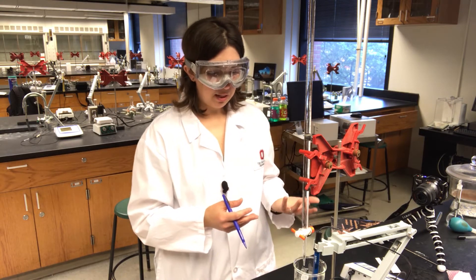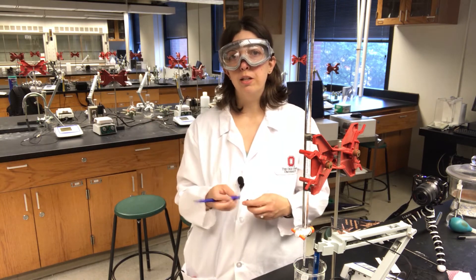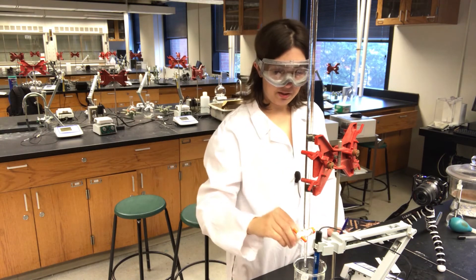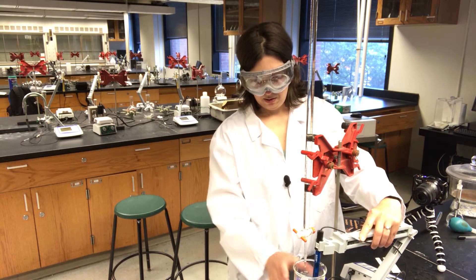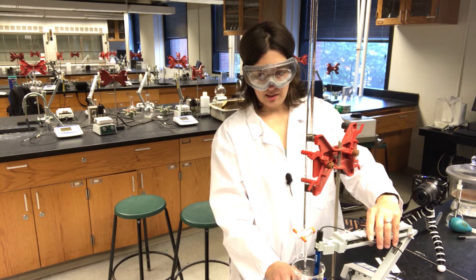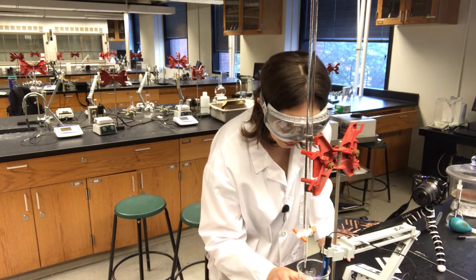I'm going to add about a milliliter or half a milliliter and record the pH until the pH is increasing enough that I think I'm getting close to an equivalence point. Oh, I almost forgot — I need to stir my solution, so I'm going to add a stir bar and turn on my stir plate.